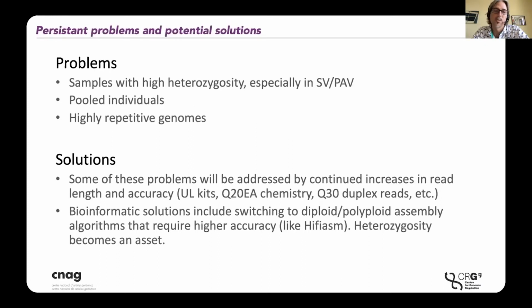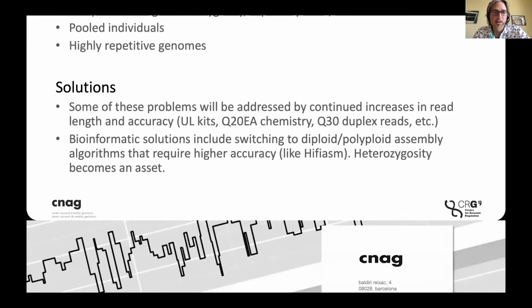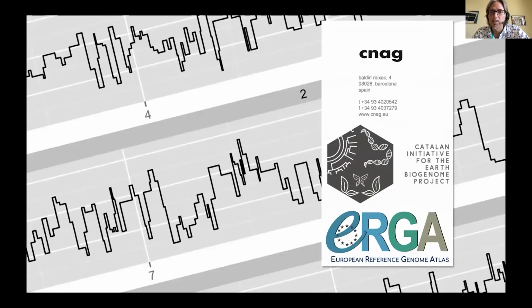So it's very important to match, let's say, the overlap length and tolerated errors correctly to the chemistry. And so we continue benchmarking. And that's all. I'd like to wrap it up and take questions if there's time.